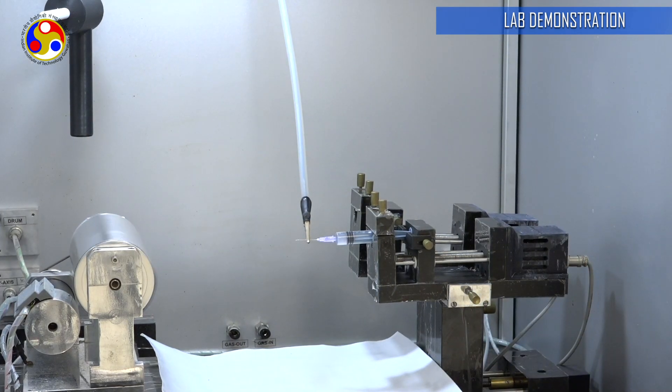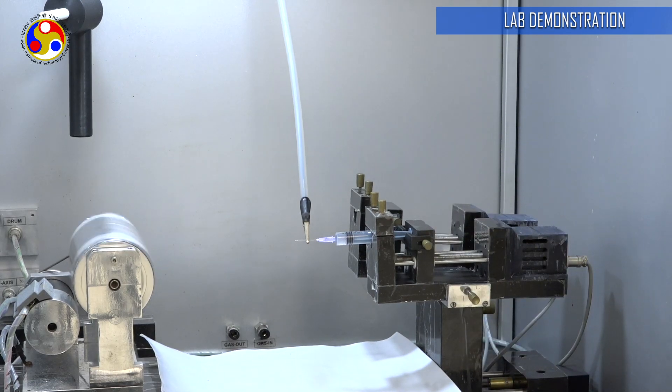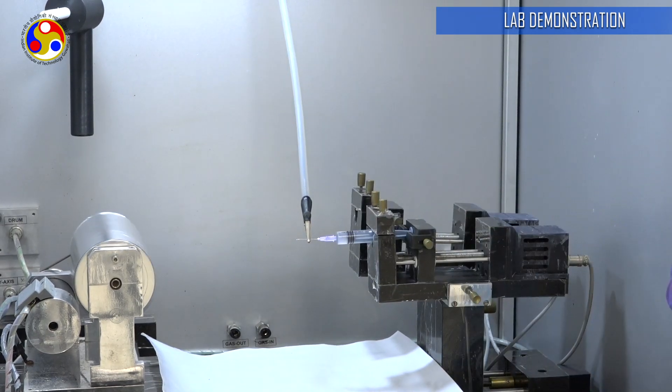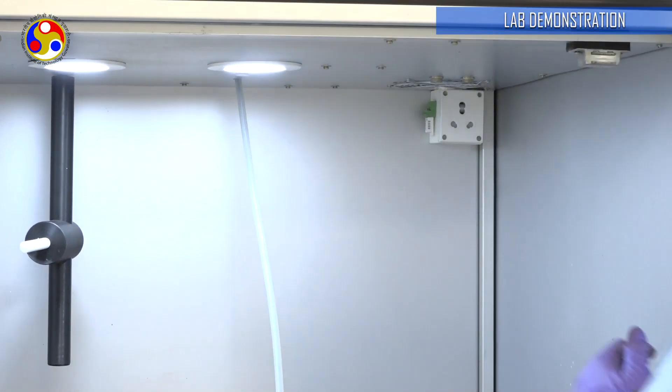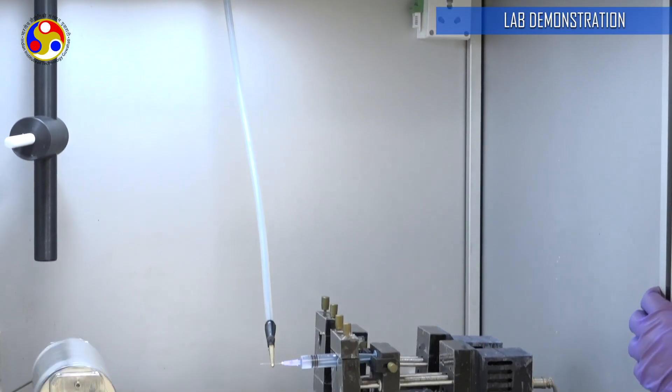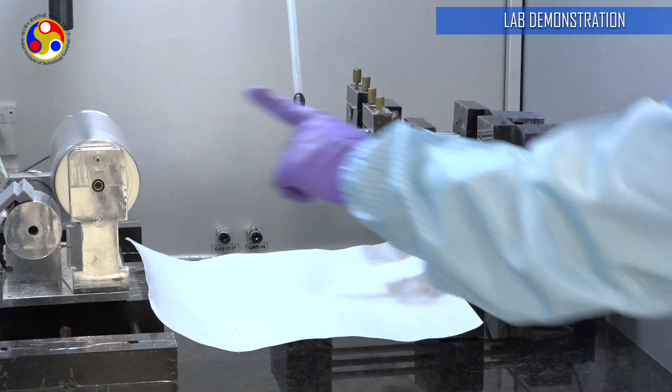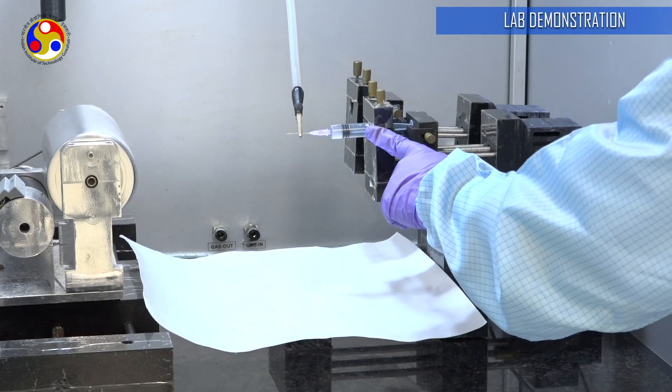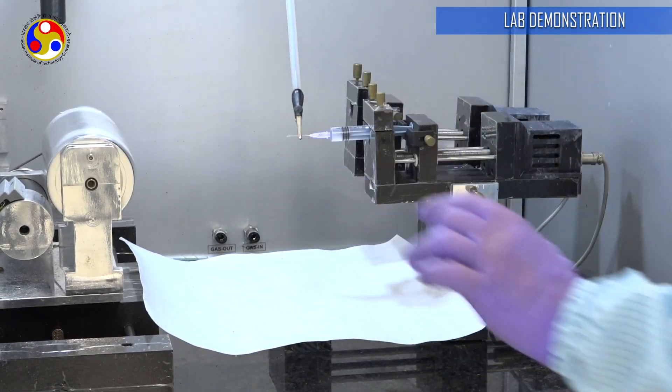These are also some secondary parameters, the ambient condition such as chamber temperature and humidity. You can adjust the temperature of the inside chamber by connecting a heater to this plug point here or a dehumidifier, whichever you want. My collector is spinning and my sample is ready to be deposited. I just have to now turn on the high voltage power source.